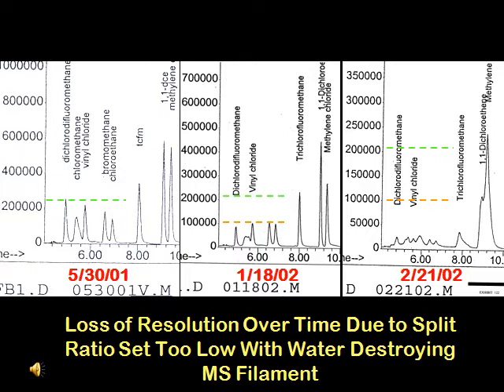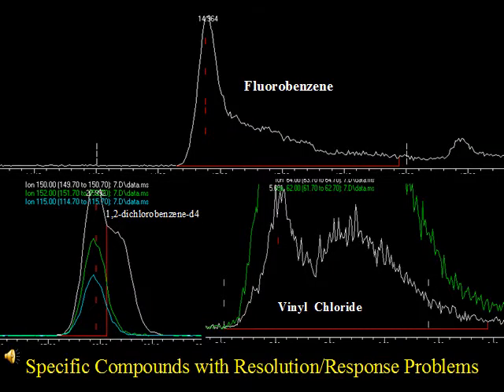The water also had the detrimental effect of destroying the mass spec filament, which was the cause of the loss of peak response. Some of the effects on individual compounds that this water problem was having on the chromatography can be shown by the tailing of the internal standard fluorobenzene peak, the coelution of another peak with the surrogate 1,2-dichlorobenzene D4 peak, and the splitting of the vinyl chloride peak.